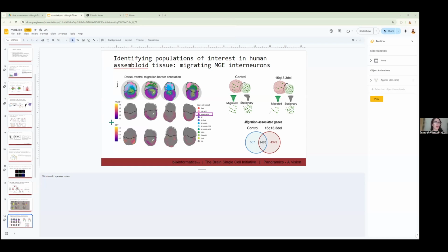I think yesterday someone asked about the possibility of having multiple sections in a chart. Since we work with neural organoid tissue and it's so small, it's definitely something that we've found possible with Visium HD. The only caveat is you do get some dropouts. So we were only able to capture these 3 tissues here. So these guys were just for looking at. And so within the SPATA2 function, you're able to color your sections by either nothing, showing just the H&E.